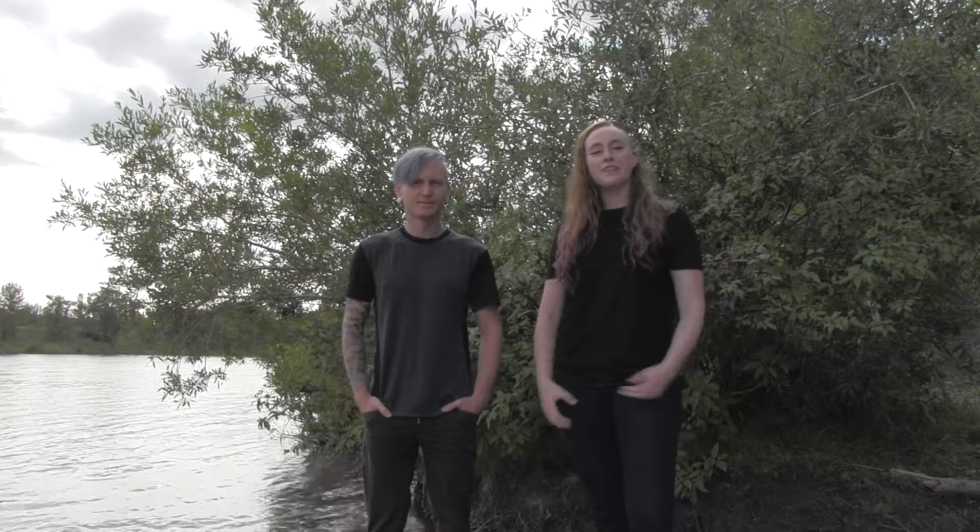Hi everyone, I'm Jessie Booklist and I'm James Bull. We're researchers from the University of Calgary. Thank you for agreeing to be part of our research efforts. This video will show you how to take a DNA sample from a finfish, and we use these samples to investigate the genetics of populations of wild fish.